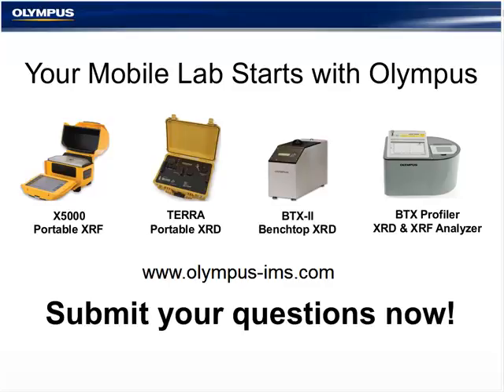In the case of the Terra and BTX2, they use about 15 milligrams of sample. That's about it. For the Profiler, you would load 25 milligrams into the sample cell for XRF. The X5000 requires minimal sample prep. I'd also like to have Dawn address from the mud logger's point of view what the sample preparation requirements are.